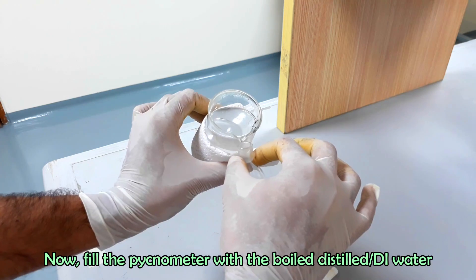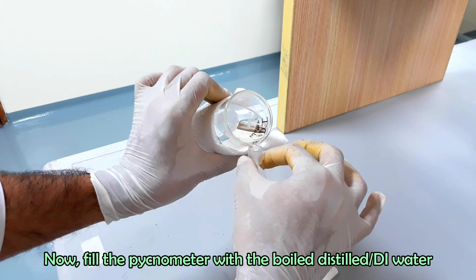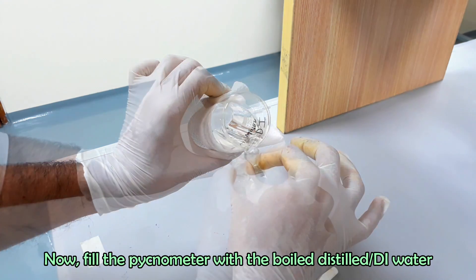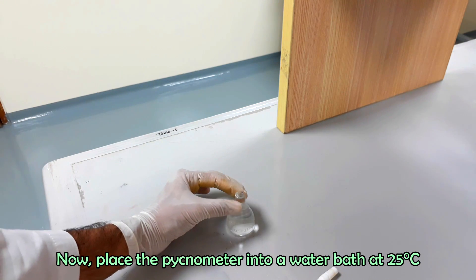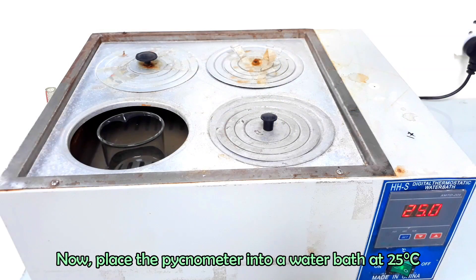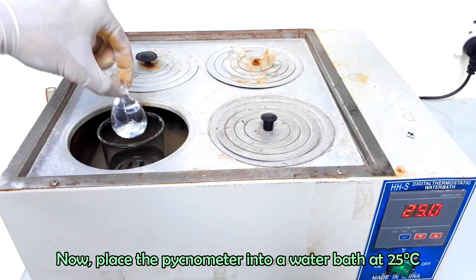Fill the pycnometer with boiled water. Now place the pycnometer into a water bath at a constant temperature of 25 degrees Celsius for 30 minutes.